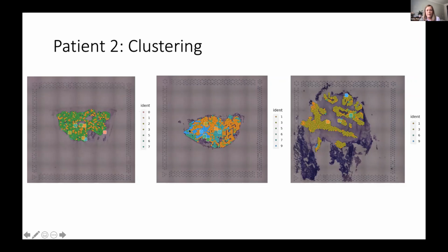In terms of the tumour tissue here, we're seeing that kind of a normal looking tissue in teal. I would say it's probably not the same cluster colour as the adjacent normal because it's right next to the tumour. So the adjacent normal tissue is taken right from the ends of the resected colon, which is often quite a big chunk. So it can be quite far away from the primary tumour. And then this time in blue, we can see this is likely a stromal area, and in orange and this kind of yellowy brown colour, the more malignant regions.